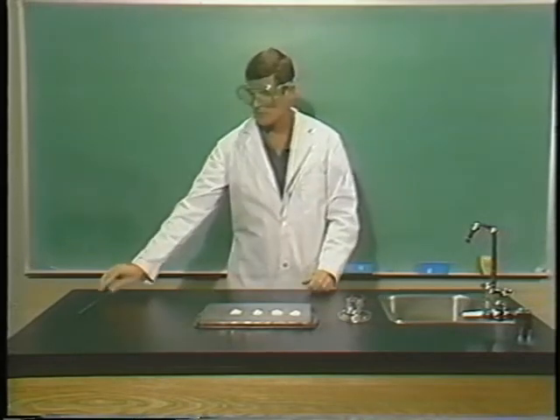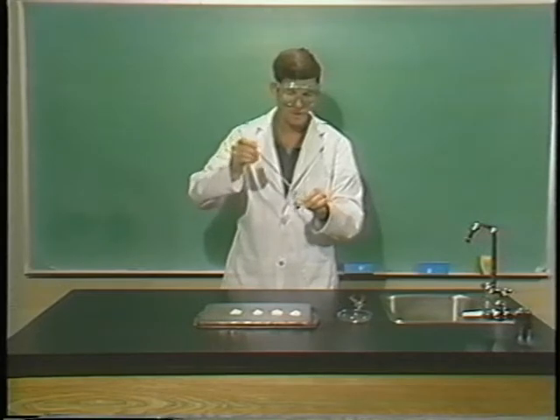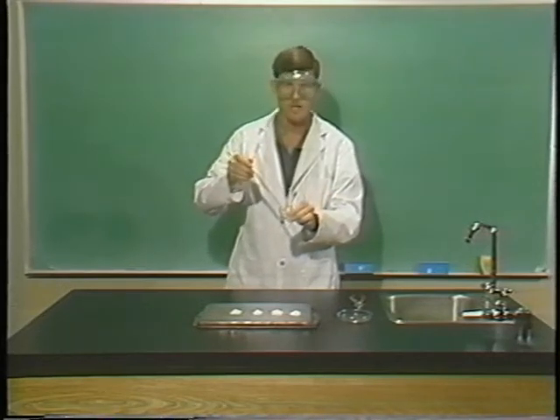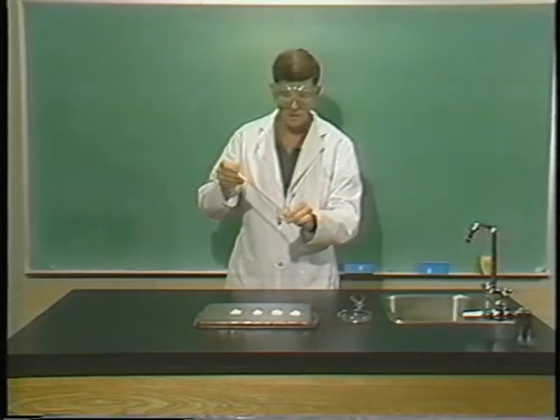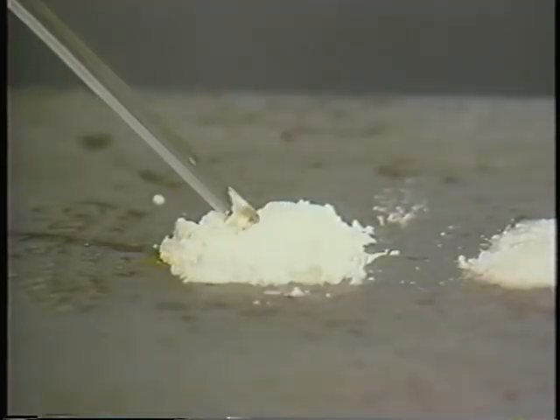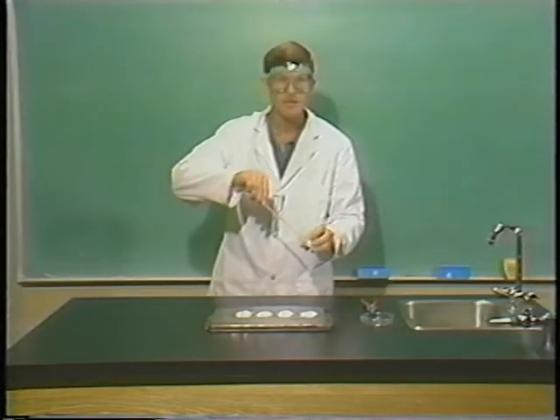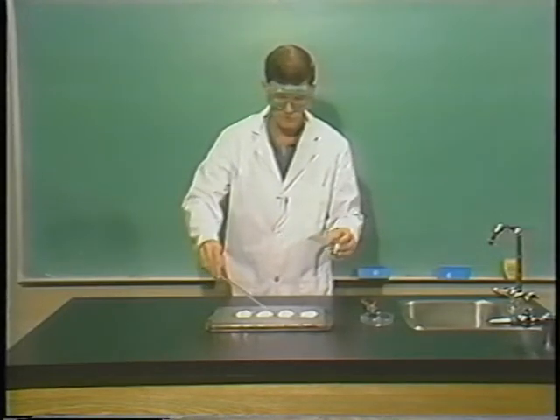Now, what we're going to do, take this glass stirring rod and this little beaker with water in it and put one drop of water on each chemical. We'll start with number one and see what happens. There appears to be very little reaction. Now let's test number two. Wow! Imagine what would have happened if we tasted that chemical.